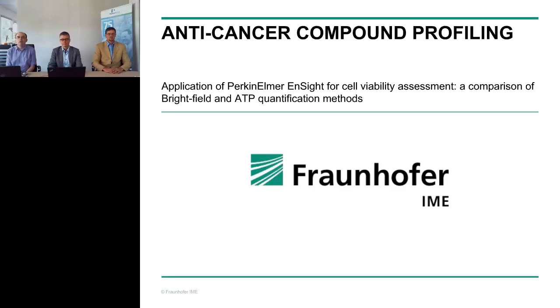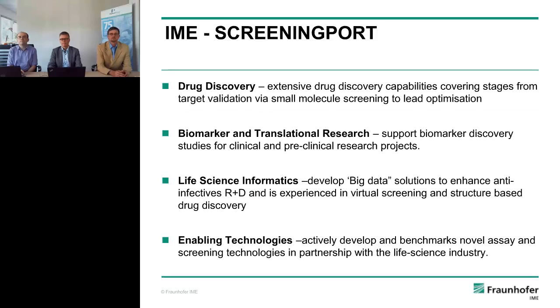Typically, we normally use ATP detection within our lab, and we'll show you some results from our existing processes. But now we want to see how we can use the bright field facility offered by the EnSight as a supplement to that, and eventually maybe we can use it to replace that as a phenotypic readout of cell viability.